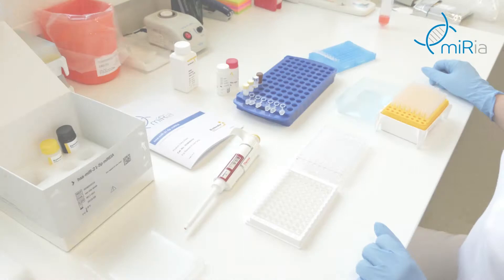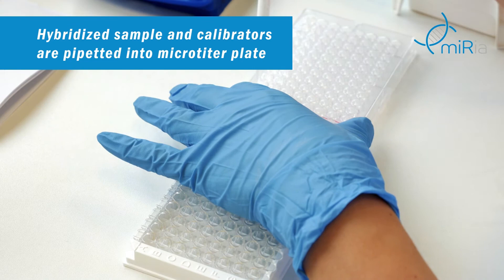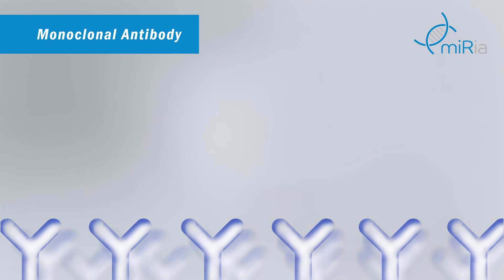Hybrid quantification is based on the immunoassay principle and the protocol is very similar to the well-known ELISA. Hybridized calibrators and samples prepared in the previous step are transferred into a microtiter plate. The key feature of this method is based on a unique monoclonal antibody. This antibody binds only to perfectly matched microRNA-DNA hybrids.